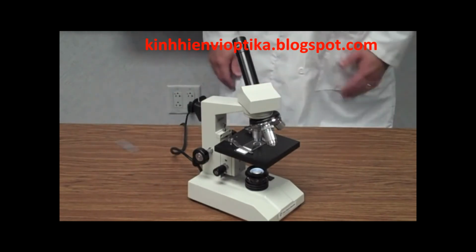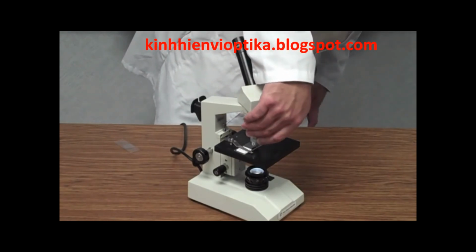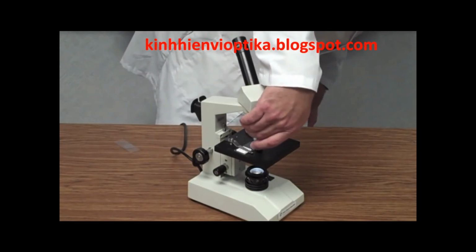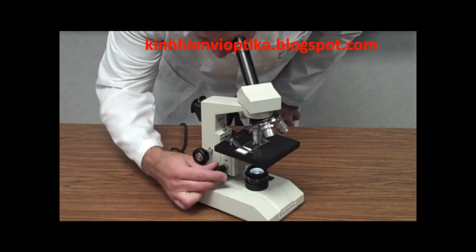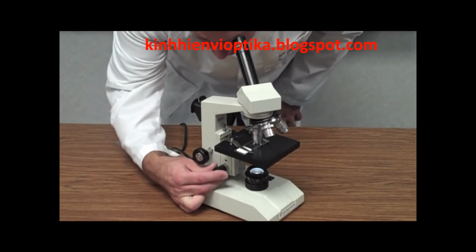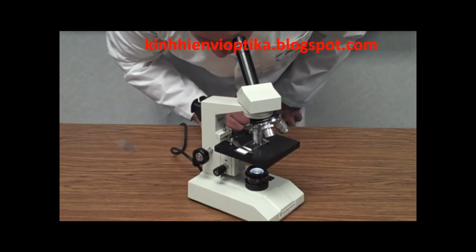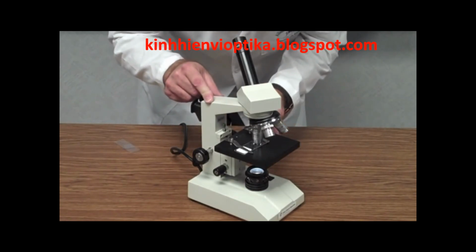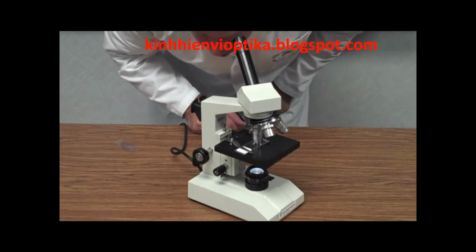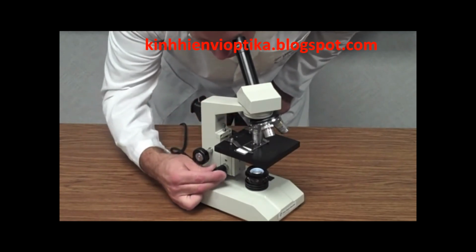Lastly, I want to look at it on high power. So again, I look from the side, I switch over to high power, being careful not to slam that objective into the stage, and again, I'm going to use only my fine adjustment knob and focus it nice and sharp. And right now, my image looks a little too dark. I'm going to adjust my diaphragm to a level 4 so that there's a little bit more light shining through, so it gives me a better picture.